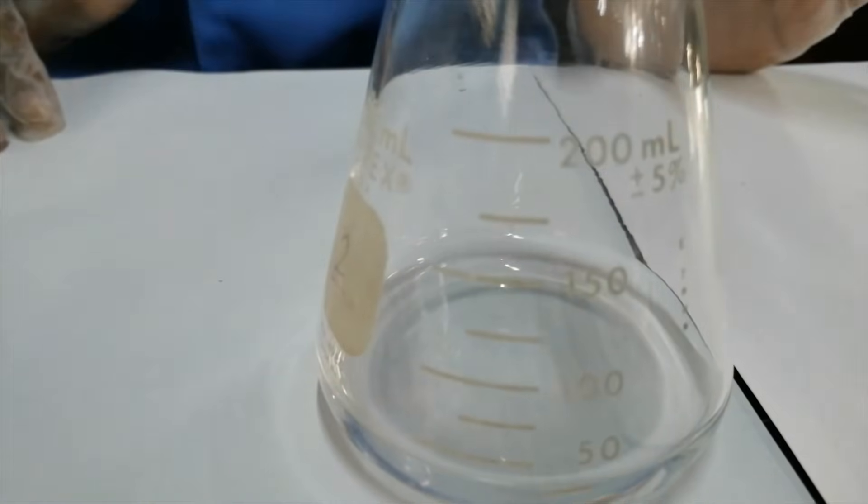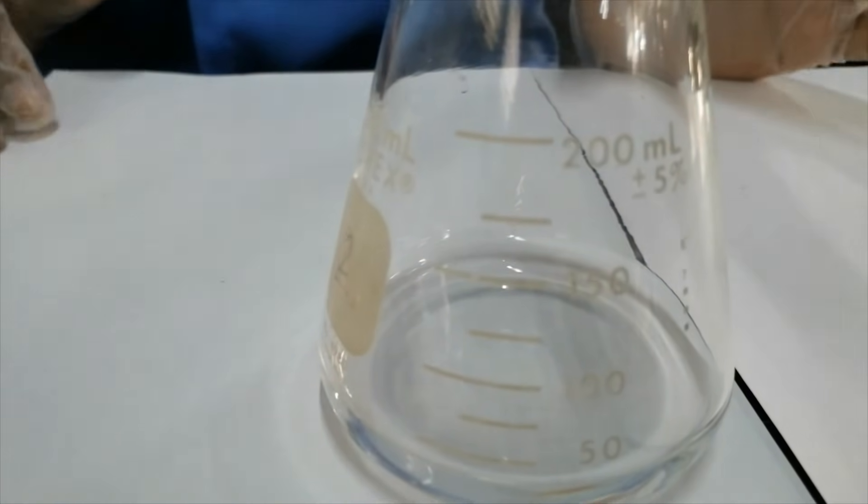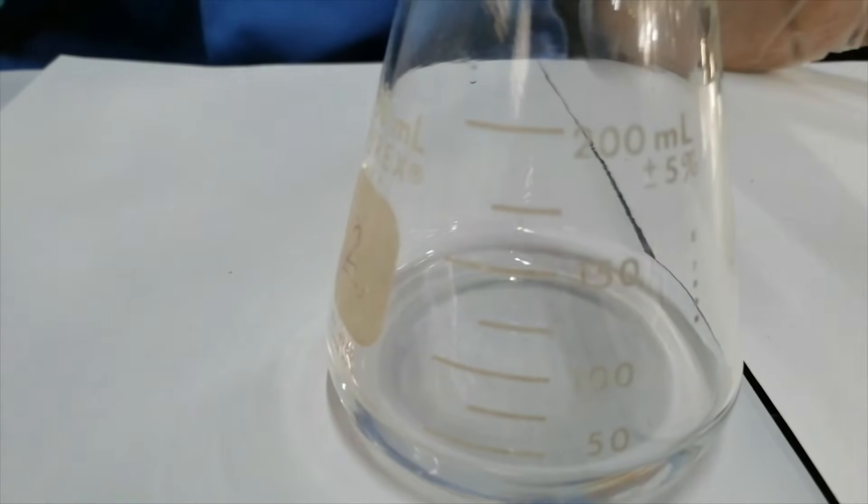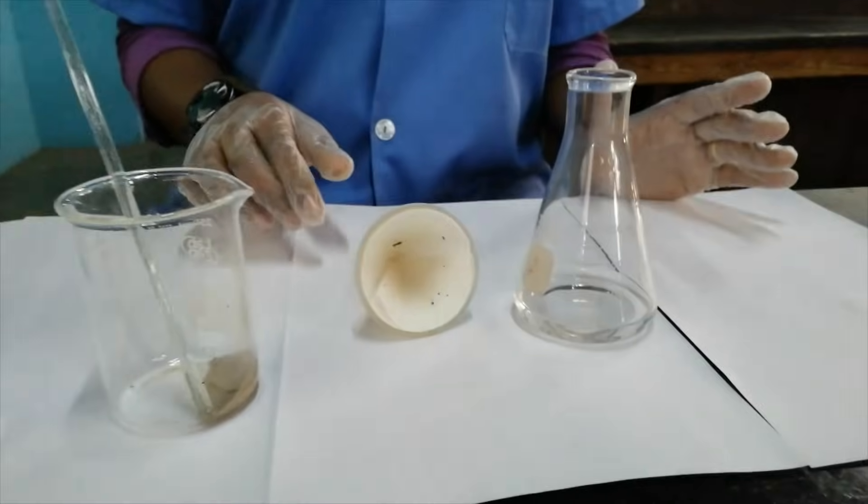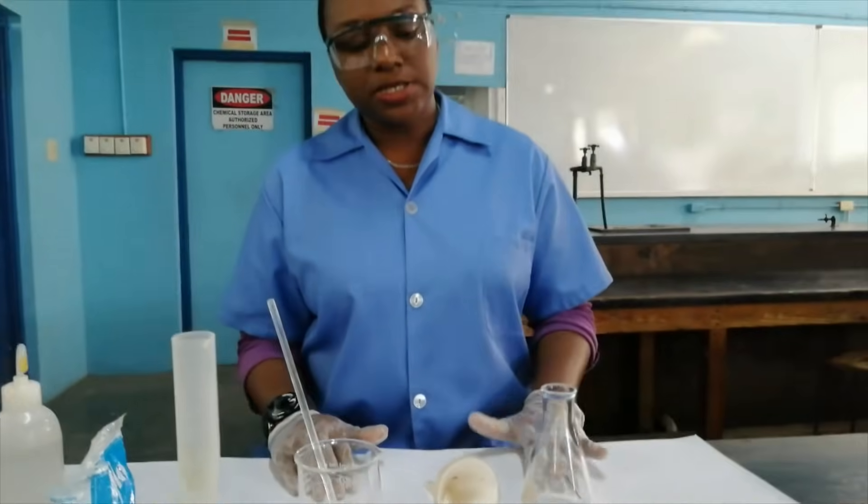If when you're carrying out this experiment in the lab it appears pale brown, then you just simply need to re-filter it. So this is the end of your experiment, and the other aspect to it now would be to evaporate this sodium chloride solution to recover the salt.